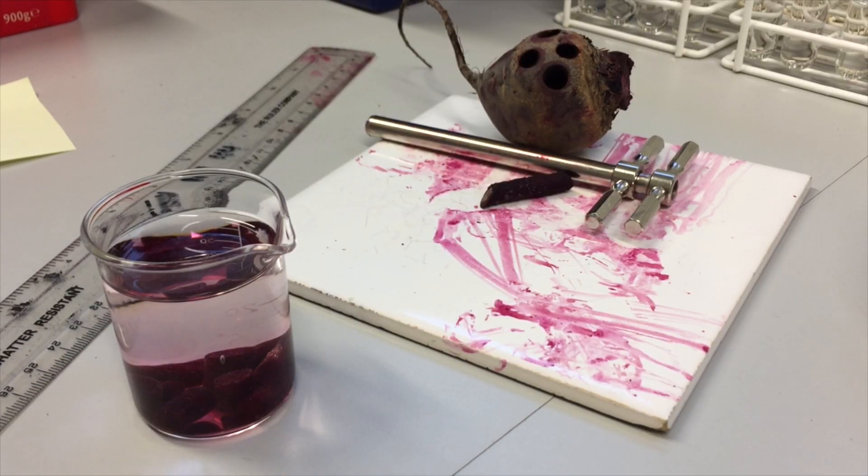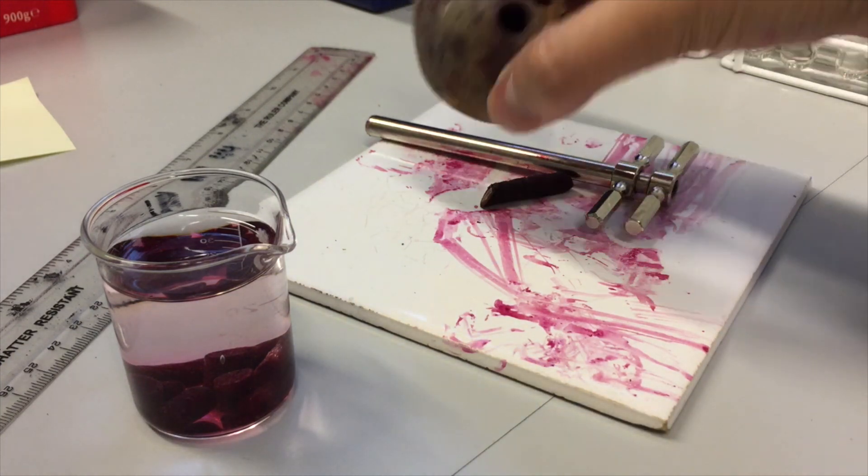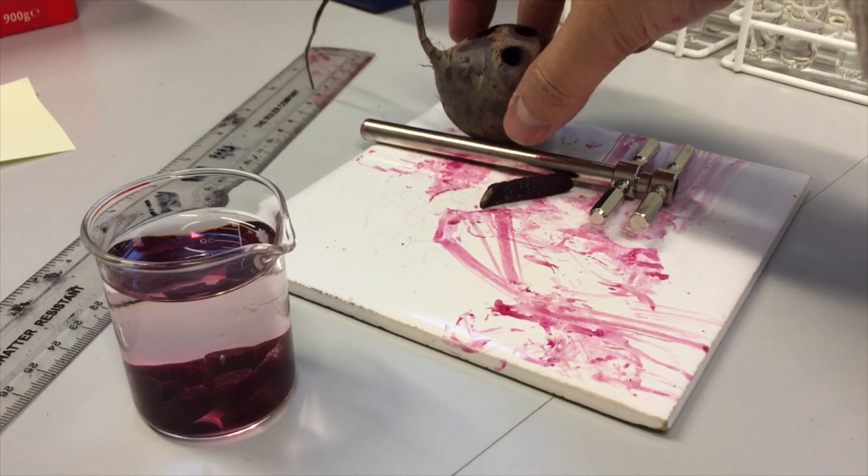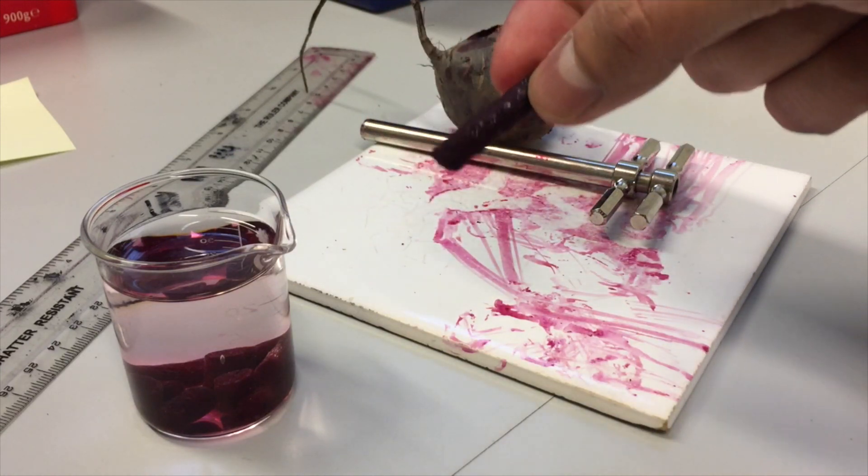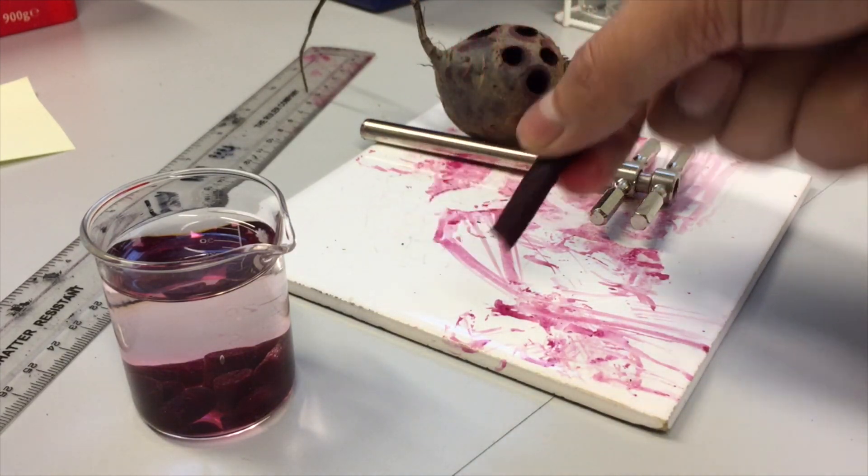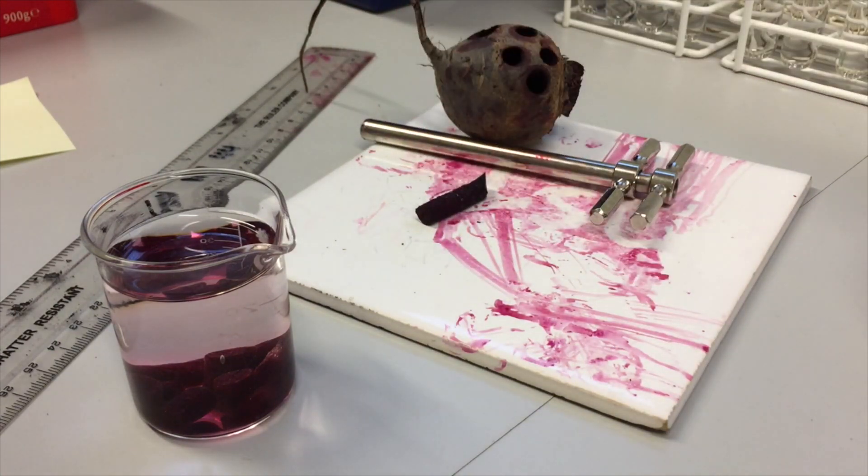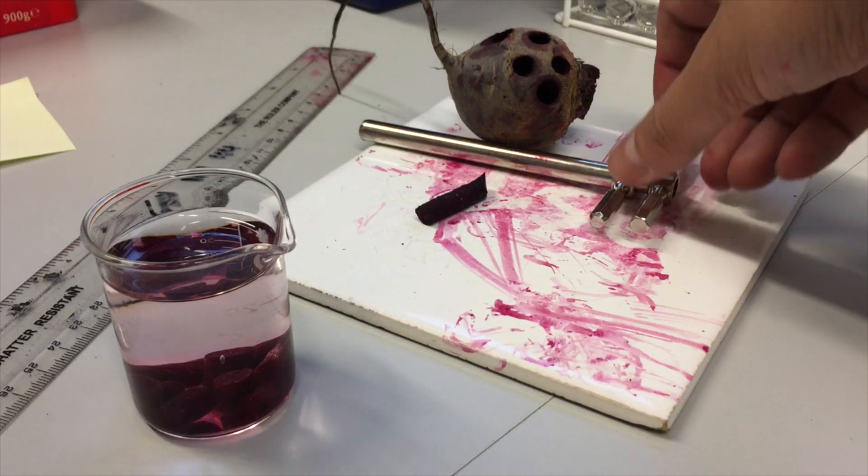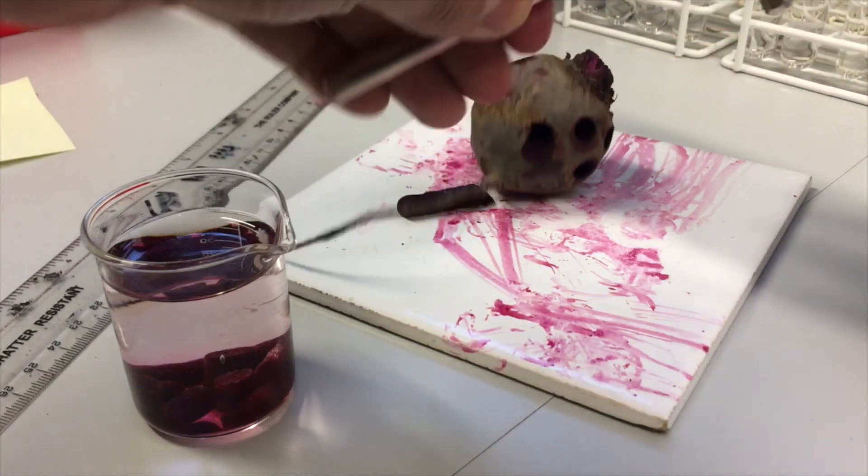So to continue the experiment, what we are going to do is look at that membrane integrity, and the readout of membrane integrity is going to be the release of a dye from cells. Now what we're going to use is cells from a vegetable, and the important thing about this vegetable is that it is highly colored. So we're going to use a beetroot.